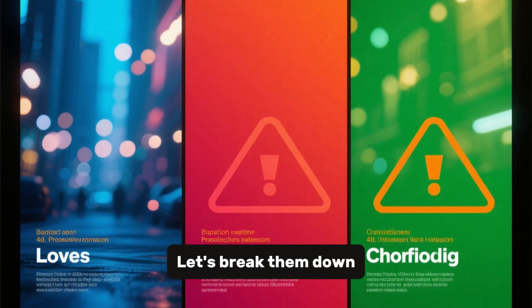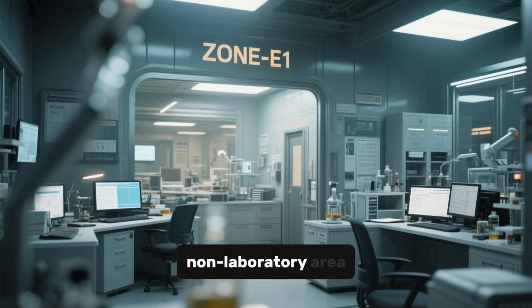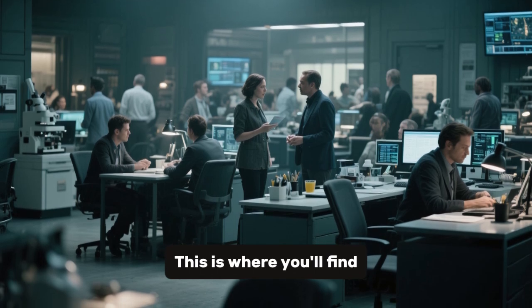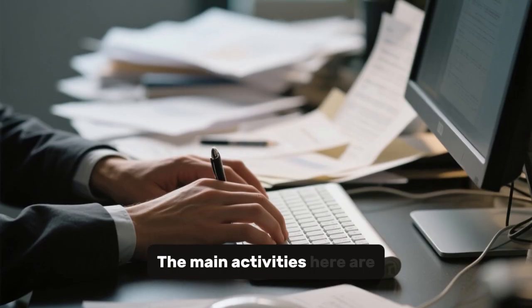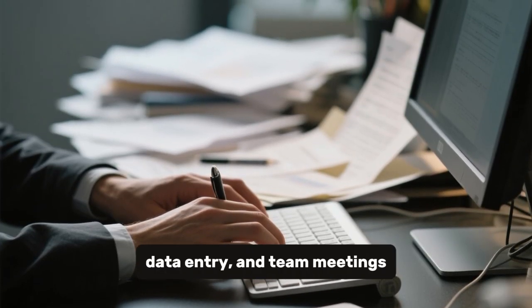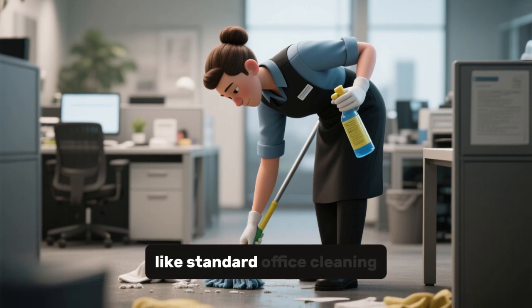Let's break them down. First up, we have Zone E1. This is your low-risk, non-laboratory area. Think of it as the lab's command center. This is where you'll find offices, administrative desks, break rooms, and meeting spaces. The main activities here are paperwork, data entry, and team meetings. Since there are no samples or reagents, the control measures are basic, like standard office cleaning.